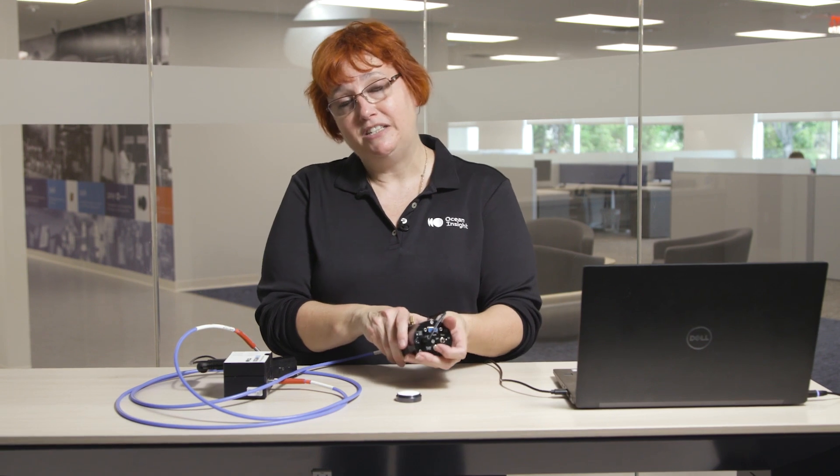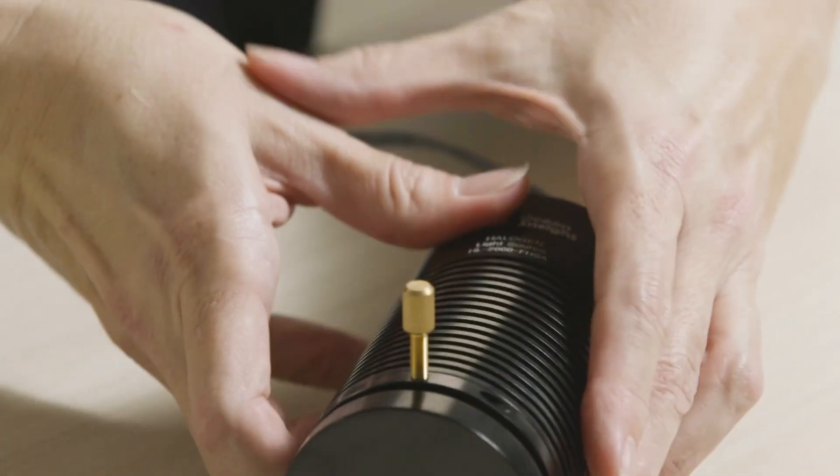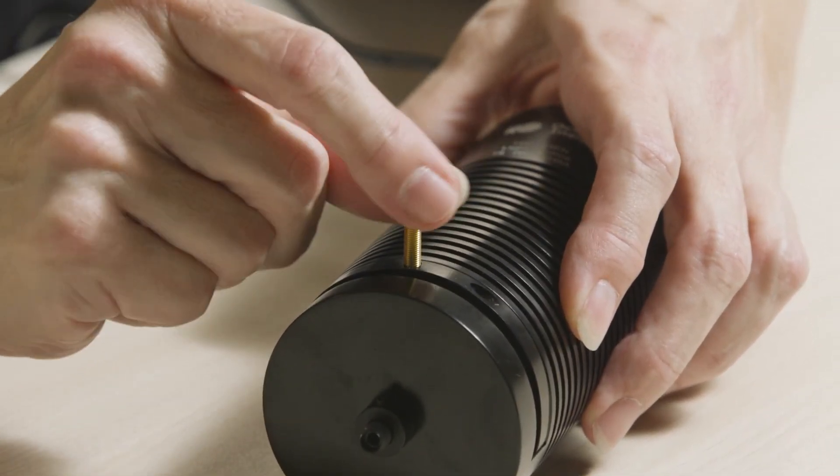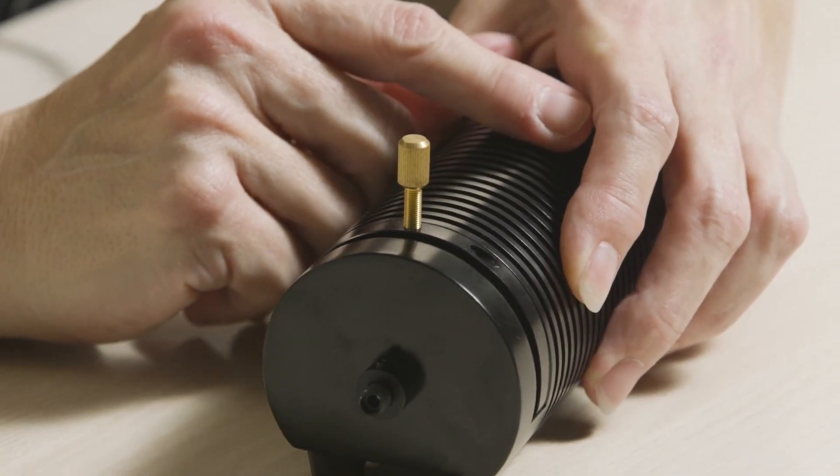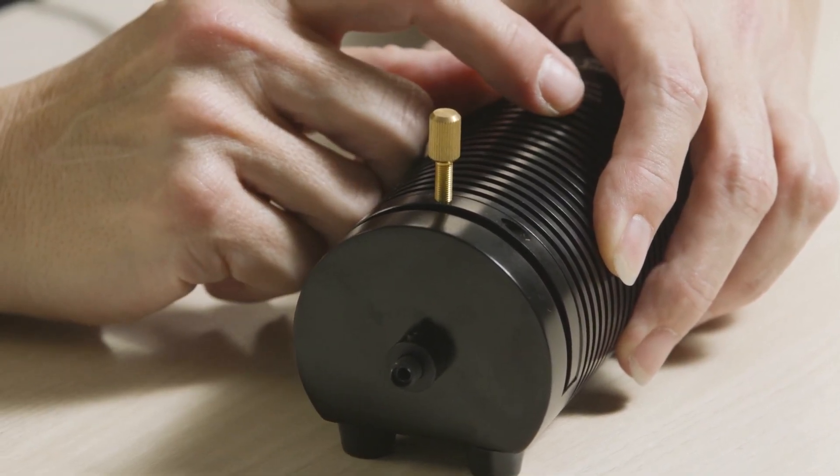We have a nice warmed up light source, and if we turn it off, then we're going to need to let it warm up for another 20 minutes before we use it. On the front of the light source, we have this screw, which will enable you to adjust the light levels. So if you have saturation in your spectrometer, you'll be able to decrease those light levels to avoid saturation.